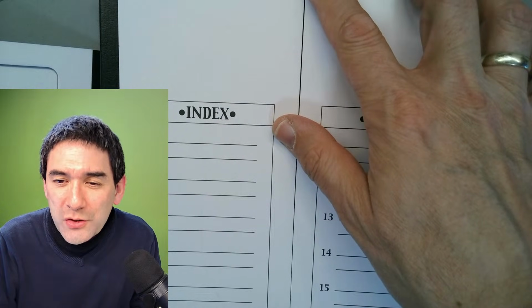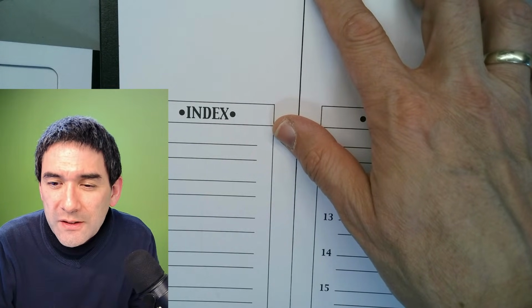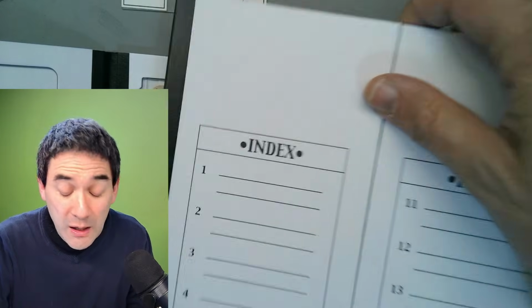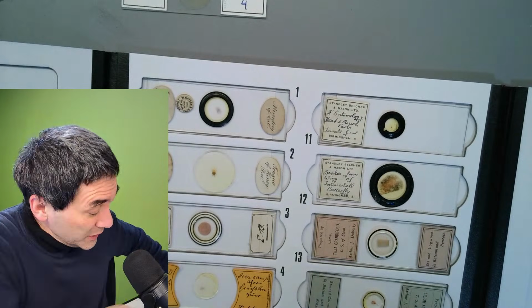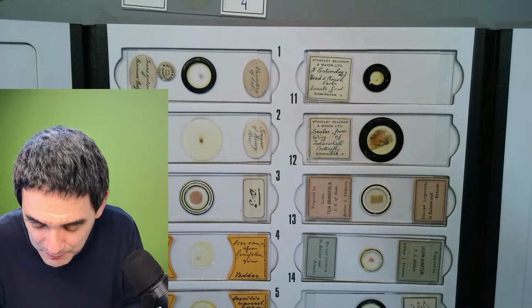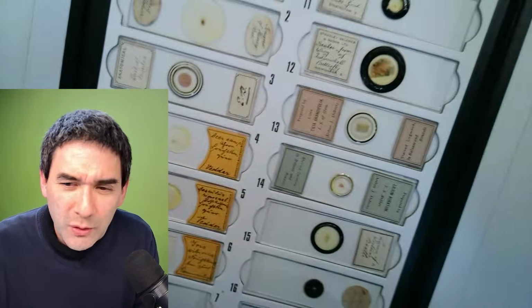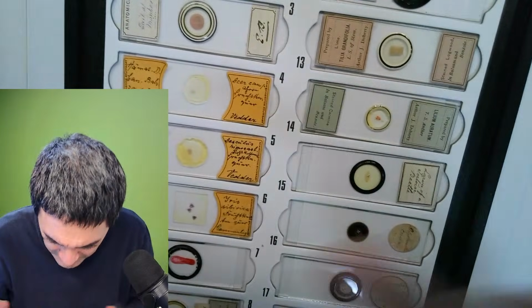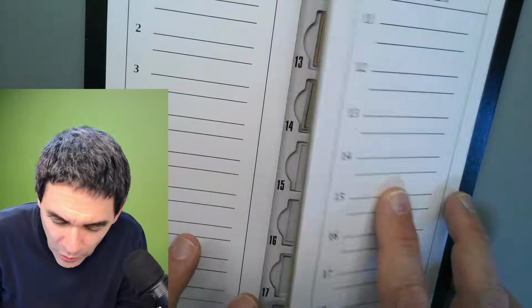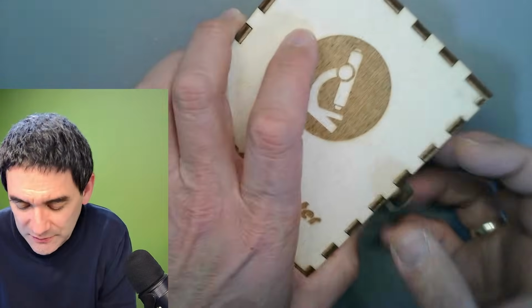While listening to the stream, I'm also looking at the edge of a moss leaf. It's only one cell layer thick. It has little teeth like a nettle emerging. That's one of the interesting things generally, that patterns in nature simply seem to appear. And then you ask yourself, how do they actually know how to make certain things? And then you discover that obviously they don't know. It simply appears out of the way that the different cells interact with each other.